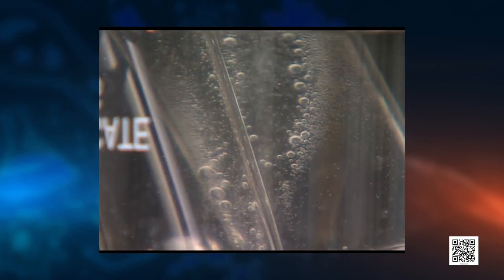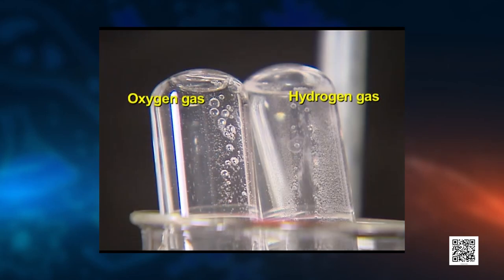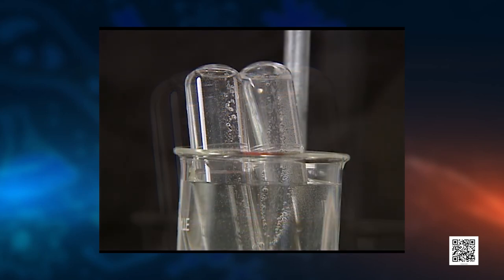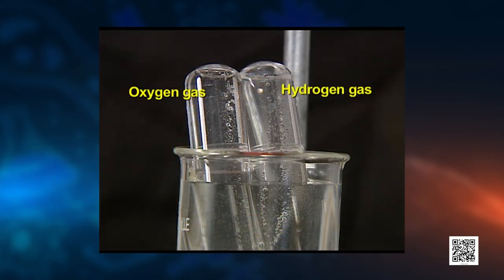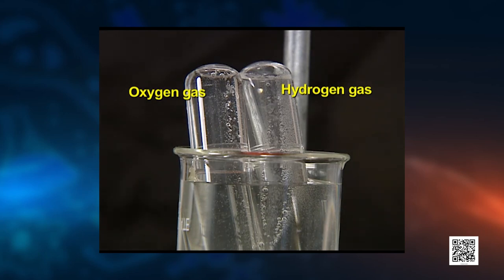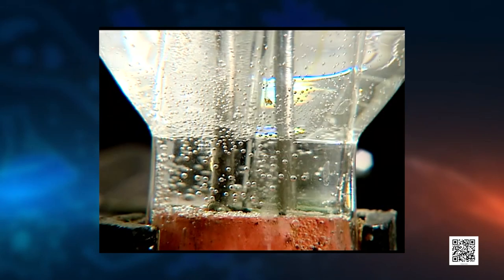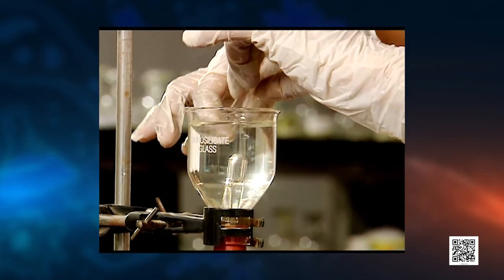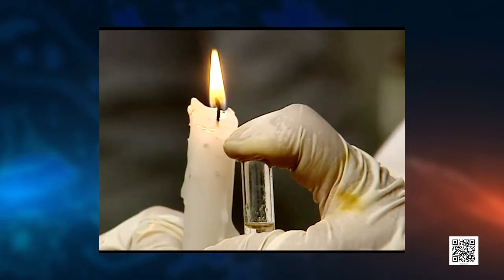You can see effervescence. Now we will test: how will you verify that the gases produced are oxygen and hydrogen? We will test these gases one by one, removing the test tubes carefully. When we remove the finger from the mouth of the test tube and place a burning splinter, a pop sound means the gas is hydrogen.